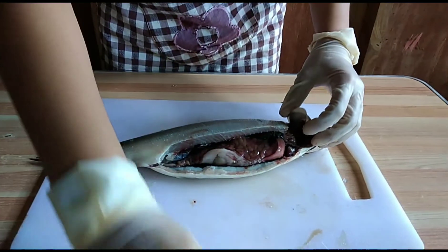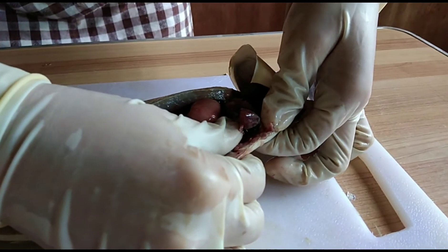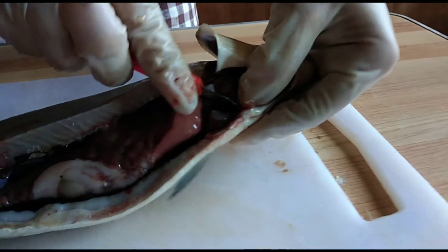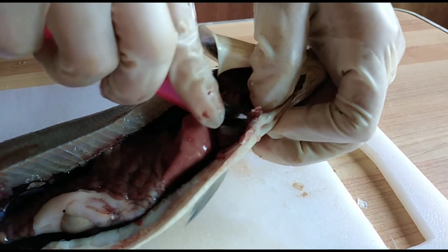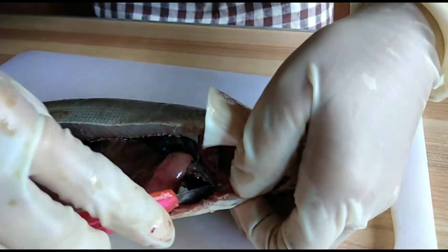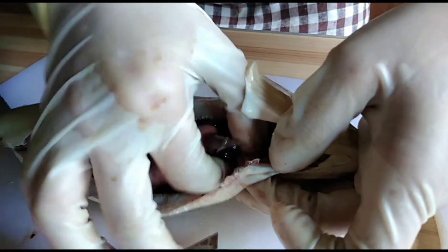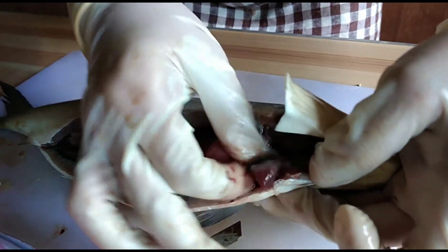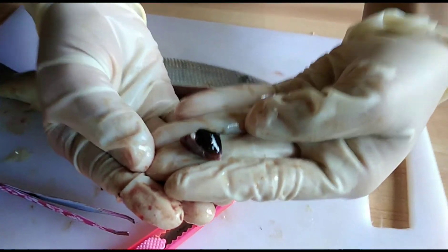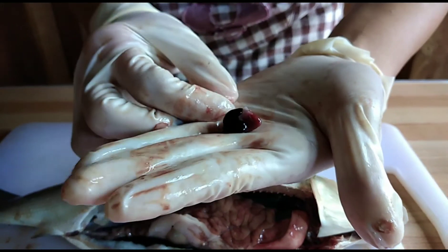Now these are the internal organs. I need to get the heart of the fish — it is located here. The main function of the heart is to pump blood, and it is called the branchial heart.